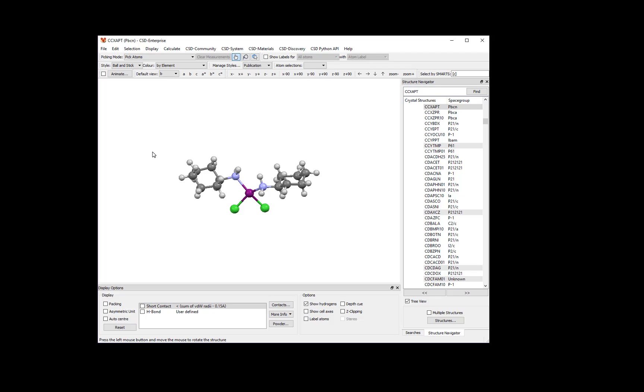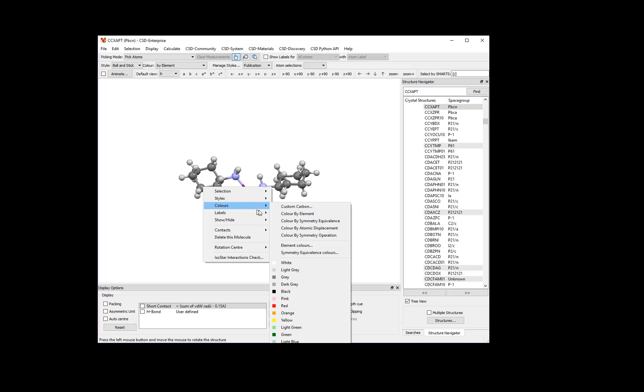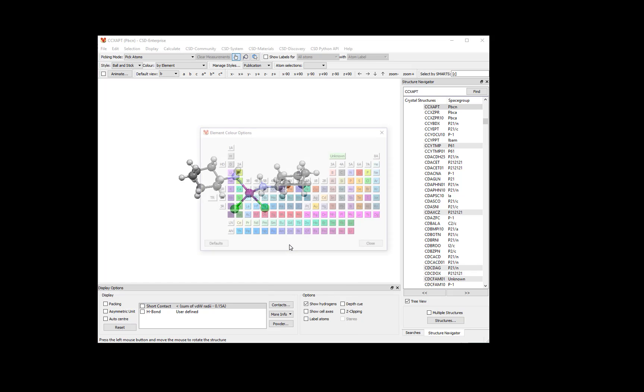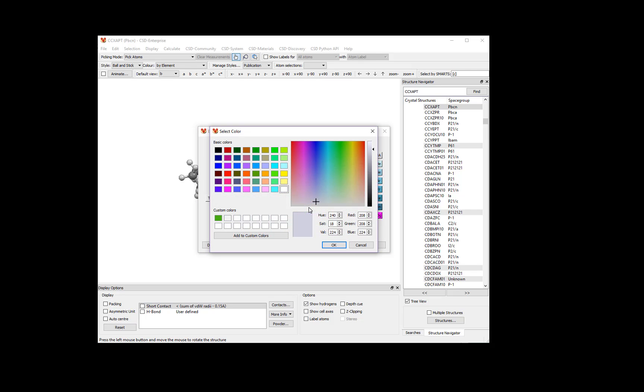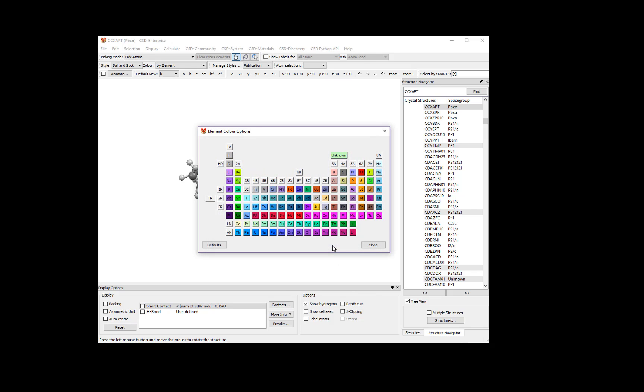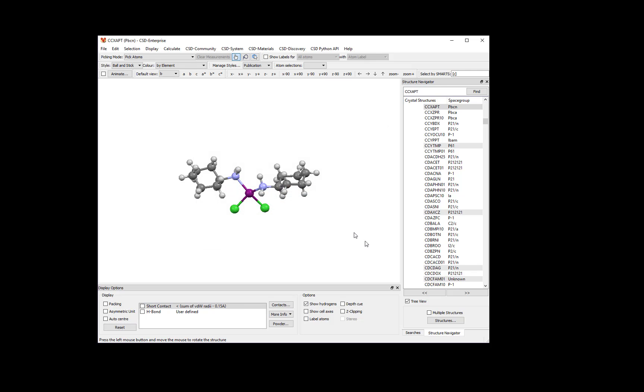To change the colors of multiple elements at a time, use the Element Colors option dialog. To access this option, right-click on any atom and select Colors, Element Colors. Here you can see the periodic table of elements as they would be displayed in various colors. Click on any element to adjust its color. When you've selected the color you like, press OK and then close the Element Color Options dialog.